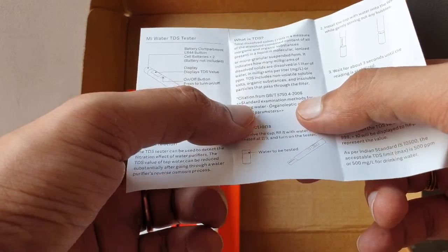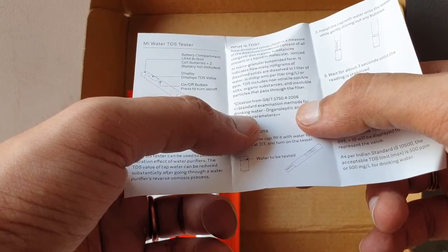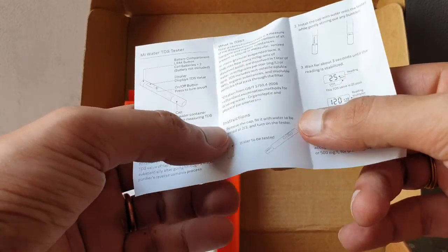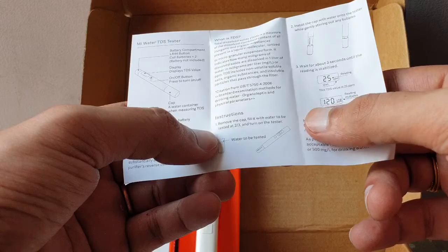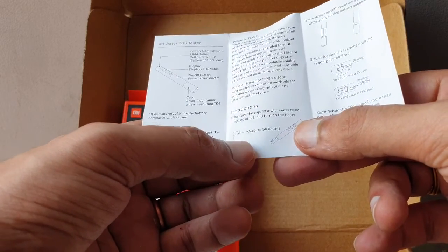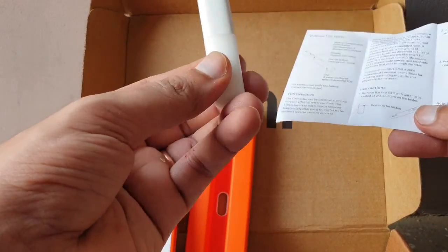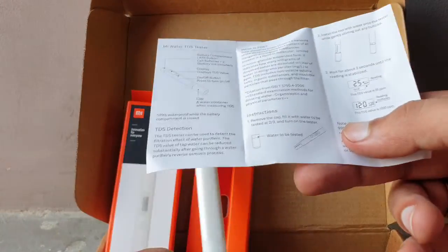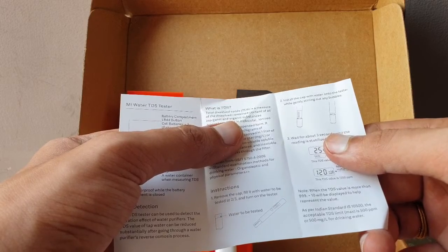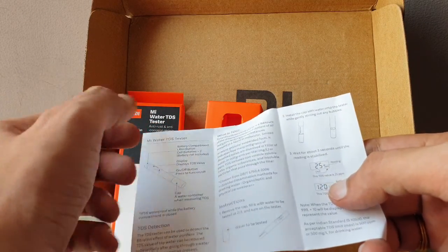TDS includes non-volatile soluble salts, organic substances, and insoluble particles that pass through a filter. To use the device: remove the cap, fill it with water two-thirds full, and turn on the tester. The water should not be completely full — just two-thirds. Insert the cap with water onto the tester while gently stirring out any bubbles. Wait three seconds until the reading stabilizes.